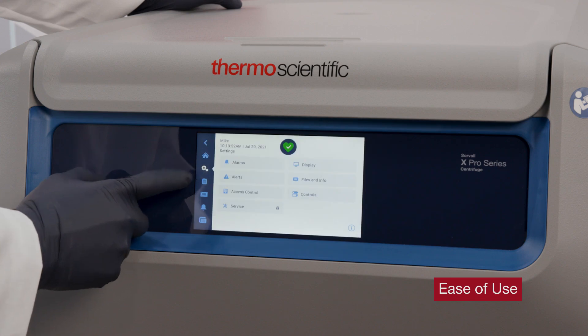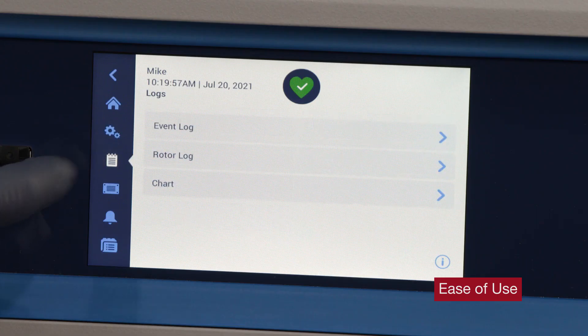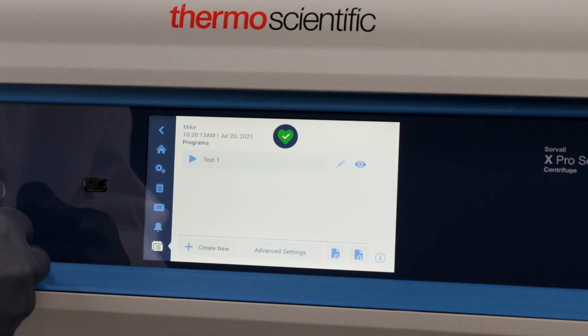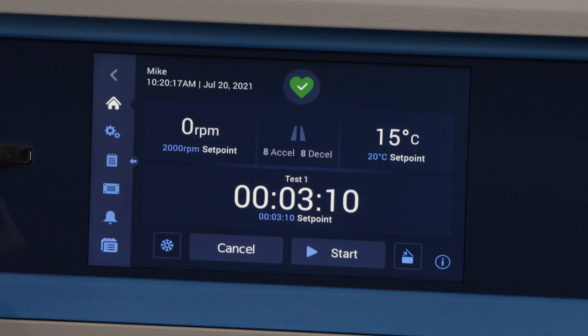Starting on the home screen, you can easily access alarms, programs, settings, and the event log with only one touch. All essential functions are represented on the home screen for easy access.